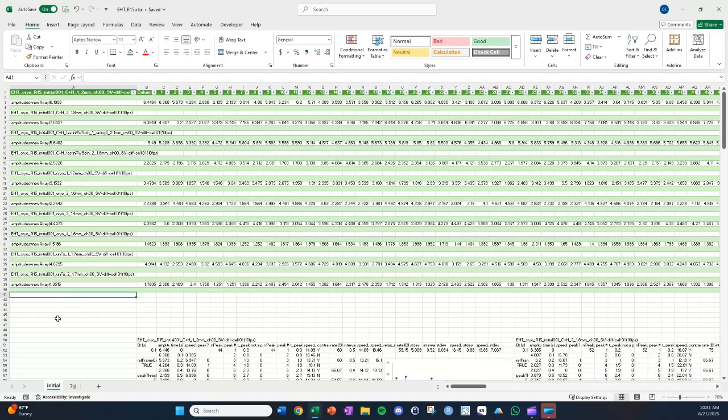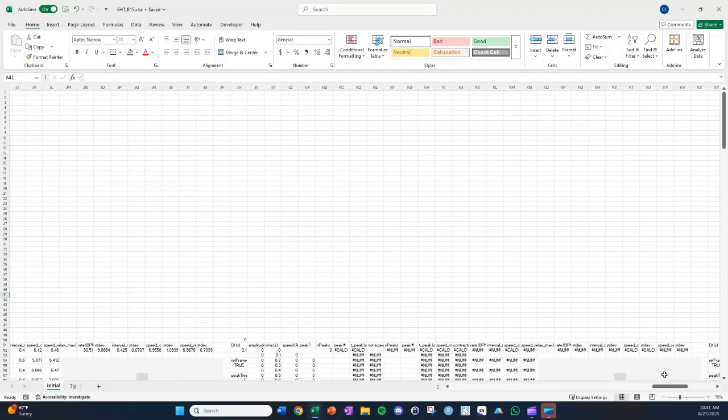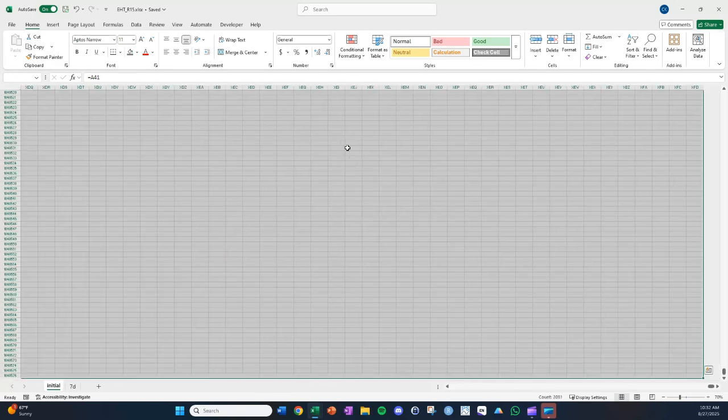It's built to handle those 14 conditions. And so in this particular experiment, I didn't actually have 14 conditions. I had 12, so I'll just delete these final two that are just going to read 0 right now.